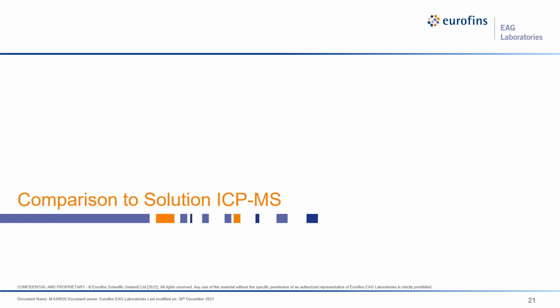So many of you may be more familiar with solution ICP-MS. So in this section, I'm just going to briefly expand on my earlier consideration of laser ablation capabilities with an attribute comparison and then a third case study.